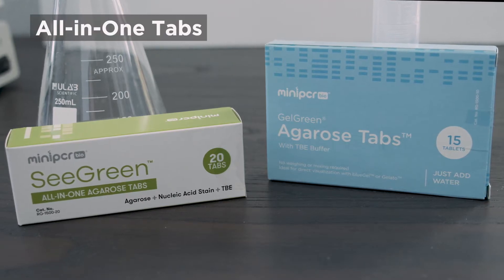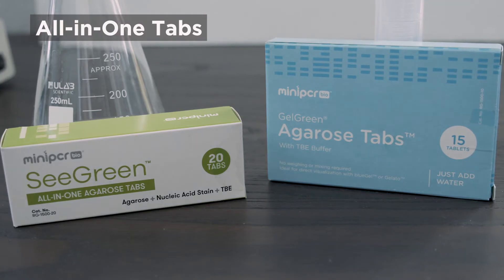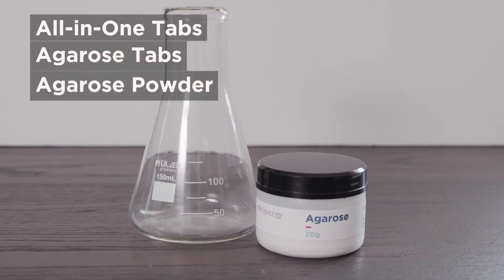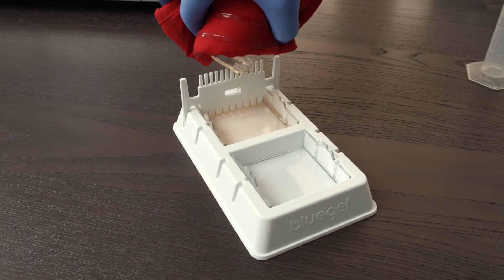Our methods will use all-in-one agarose tabs that contain TBE buffer and DNA stain, like our sea green or gel green tabs, plain agarose tabs, or agarose powder. In each example, we're going to be making one 2% agarose gel, but these instructions can be adapted for any gel percentages.